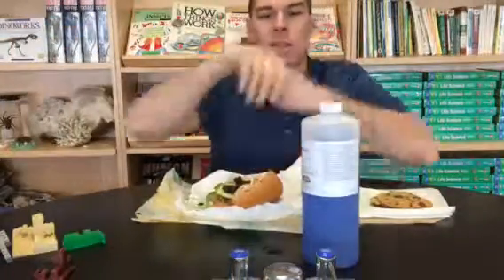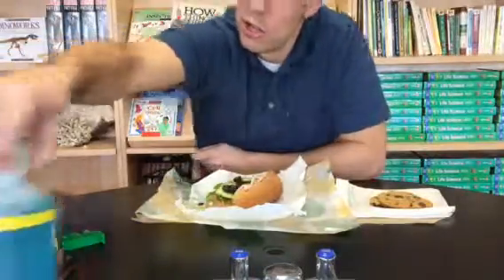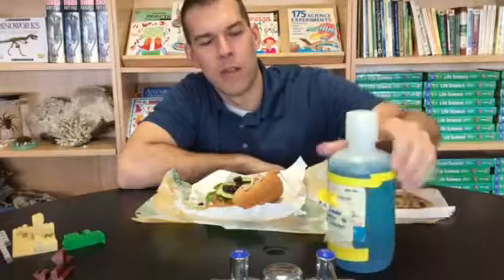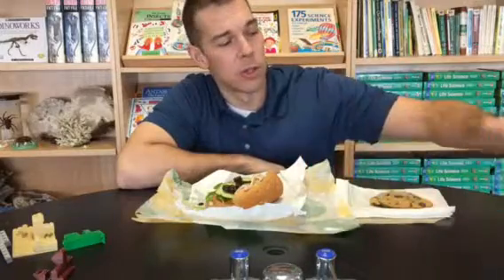We did a protein test, which we used Biuret's solution for, and the positive test with that was a little heat, and it would turn lavender on us. We did a simple sugar test, which is a type of carb. And we did that with Benedict's solution here, and that would go yellowy greenish and then to orange if it had a lot of simple sugars in it.